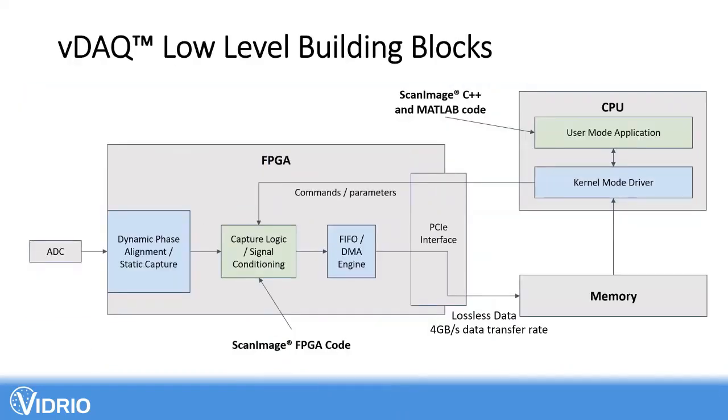So with this type of paradigm, would you have access to the frame just when the capture is over? So basically when the whole frame was captured, or do you also have access to, let's say, half of the frame as it is captured by the data acquisition board?